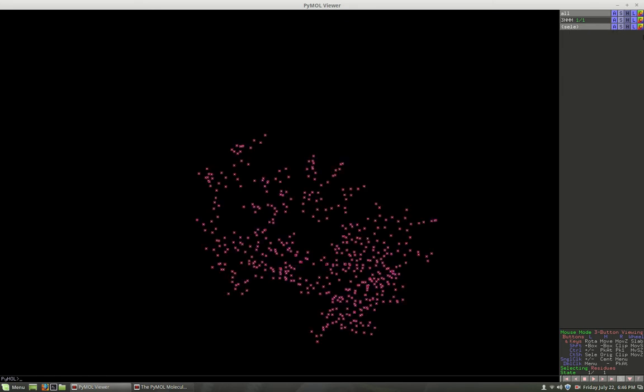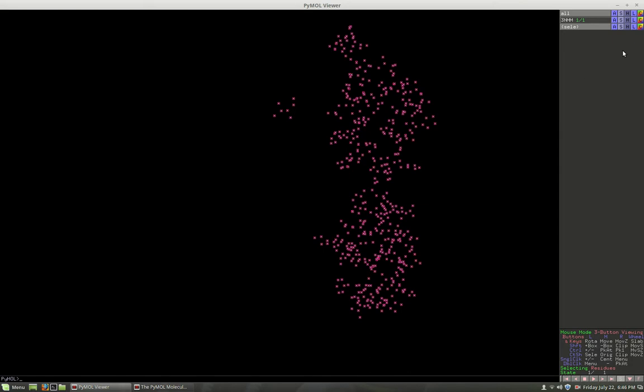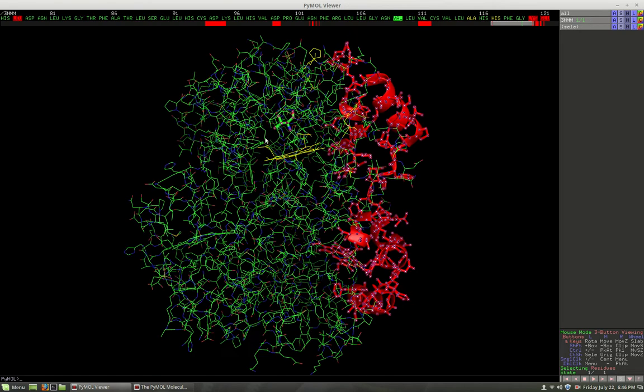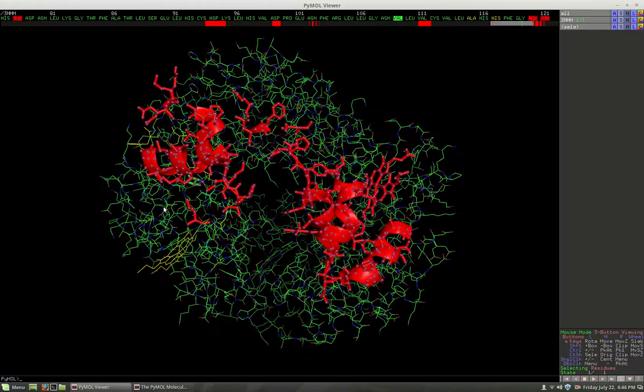So let's choose the selected piece, and let's go to show and cartoon. Cartoon doesn't show anything. Do lines. How about sticks? How about ribbons? Nothing shows here. You can rotate this, but you really don't see anything, unless you bring back the whole molecule. But of course I bring it back.